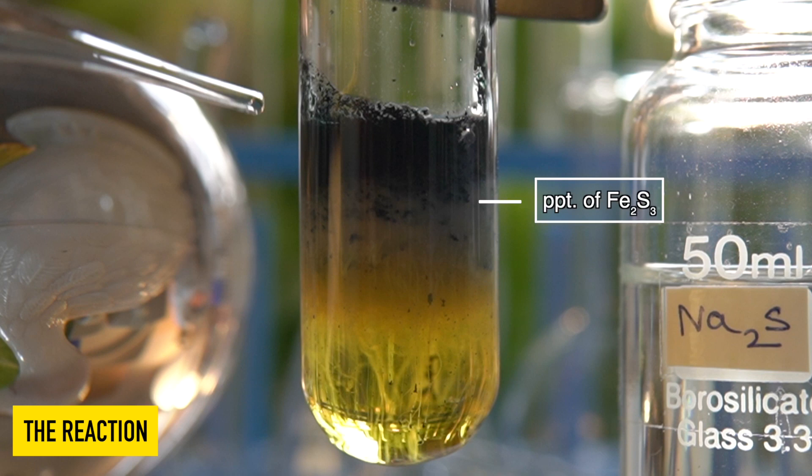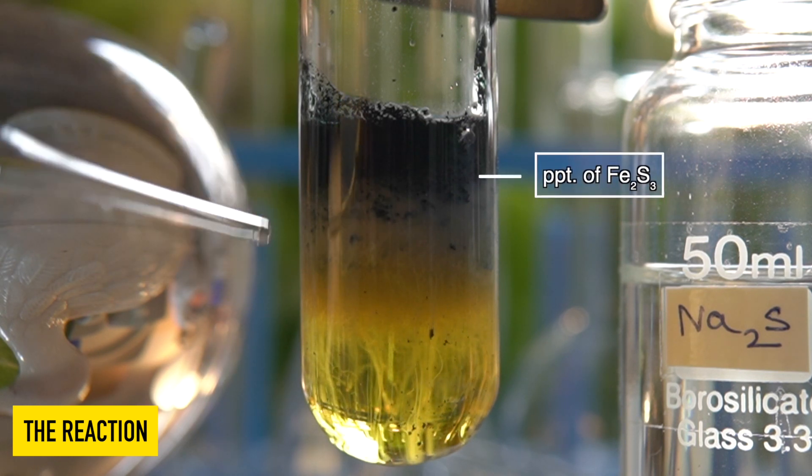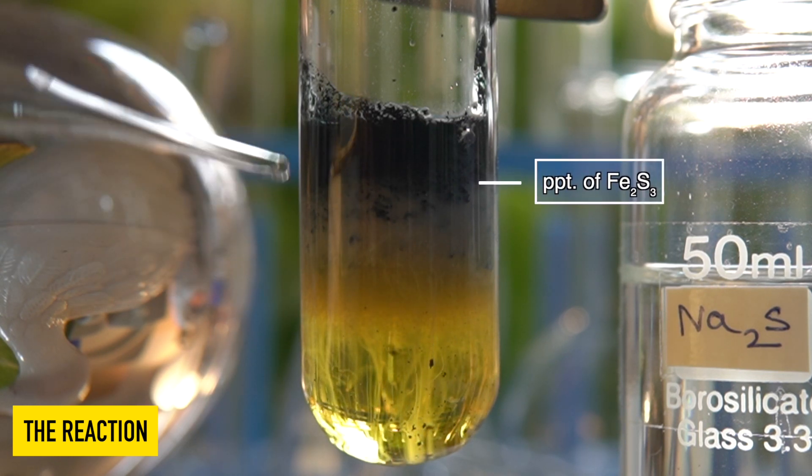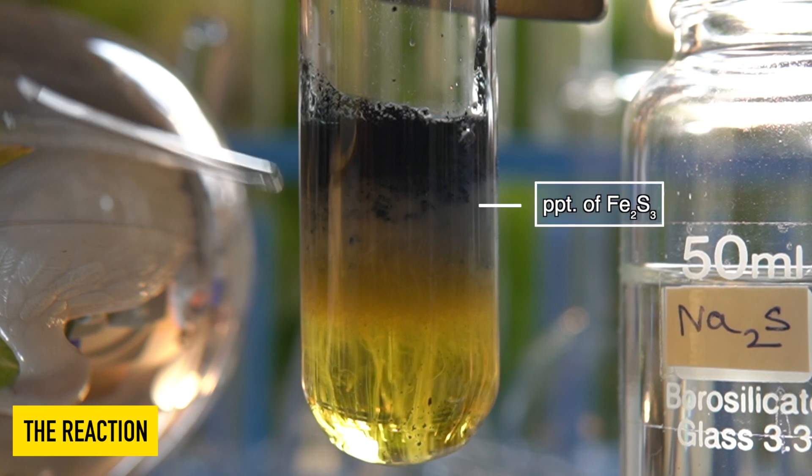The black insoluble precipitate that has been formed inside the test tube is nothing but iron 3 sulfide.